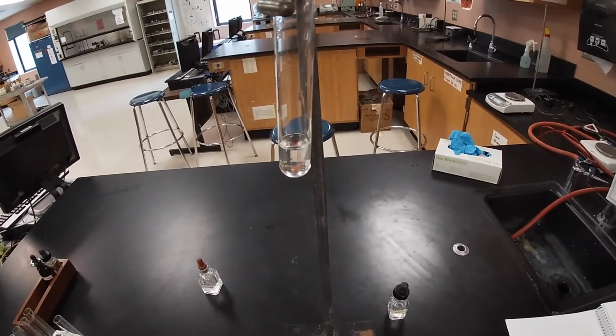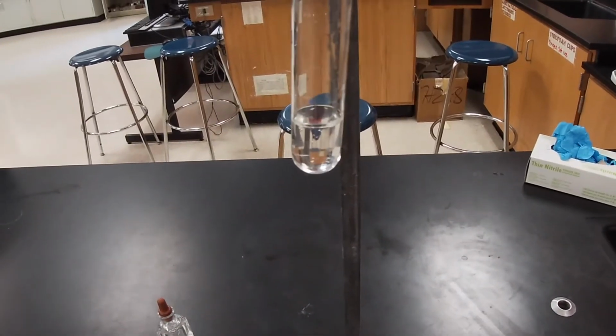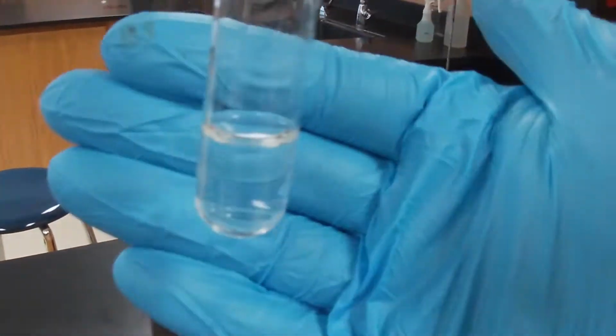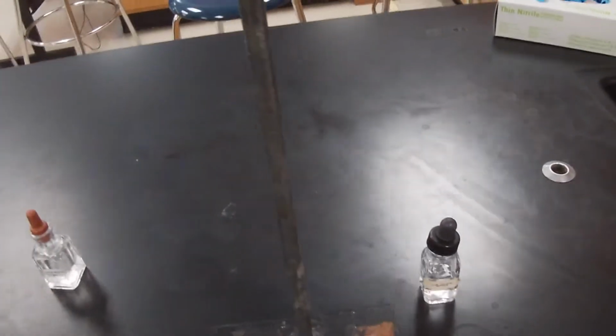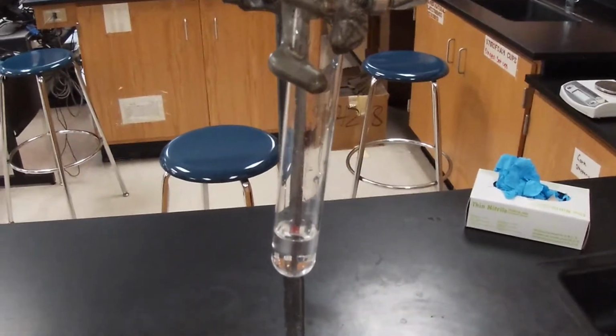I'm going to zoom in for you all. You can see our solution is still clear. No precipitate forming of any sort. So for this reaction of calcium nitrate and sodium sulfate, that is what we get.